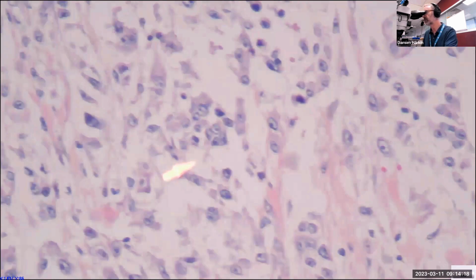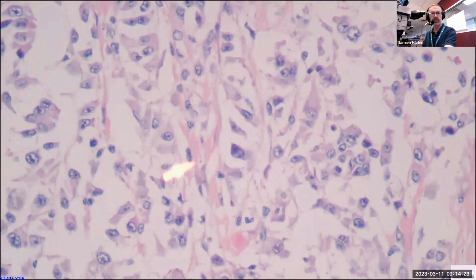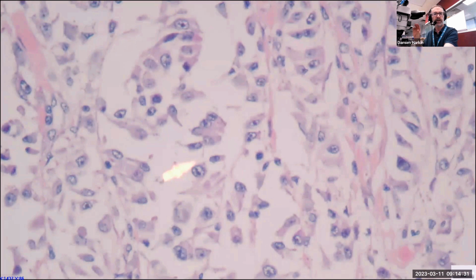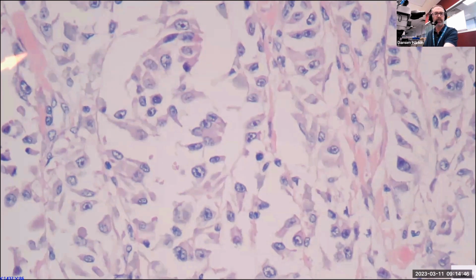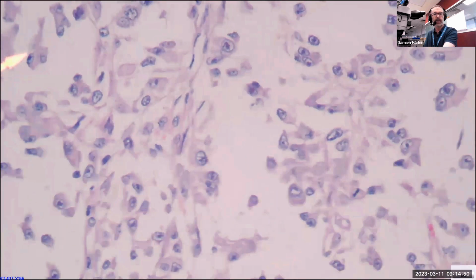This is more typical of the results that you should obtain. I think last week, in the previous video, Pigments 1, there was still quite a bit of residual brown yellow staining within these melanoma cells. But on this occasion, if I focus that a bit better, we can see quite clear nuclei. There's a little bit of cytoplasm, with background staining with hematoxylin, and there's just a little bit of eosin staining up some residual collagen fibers, which are found in that little bit of remaining extracellular matrix.